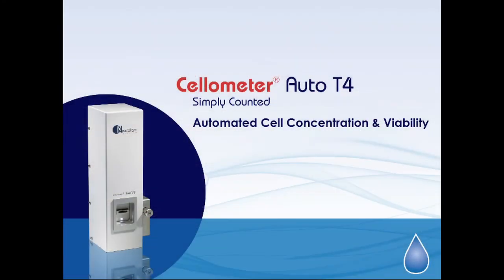Thousands of users, including the top 10 pharmaceutical companies, rely on the Cellometer Auto-T4 for accurate cell concentration and viability determination. Contact Nexalam today for more information.